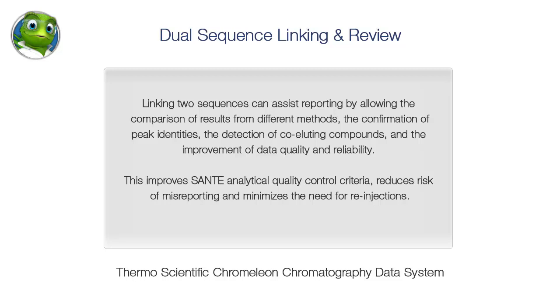Linking two sequences can assist reporting by allowing the comparison of results from different methods, the confirmation of peak identities, the detection of co-eluting compounds, and the improvement of data quality and reliability.